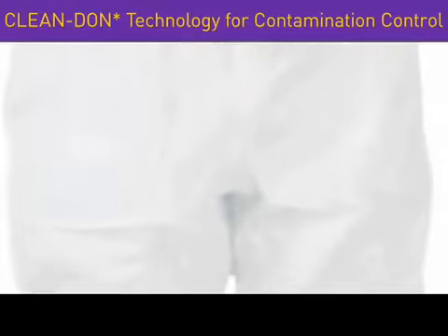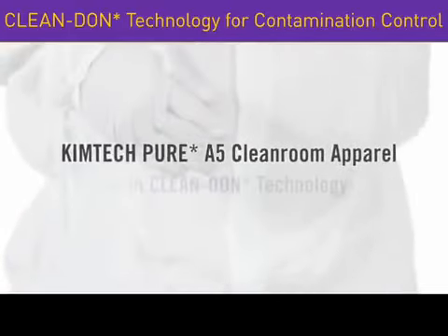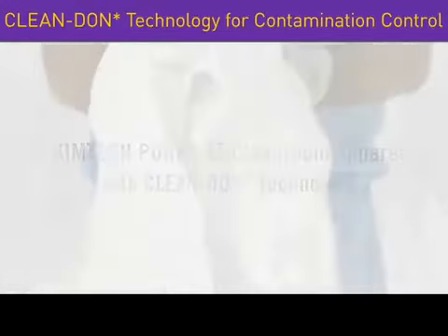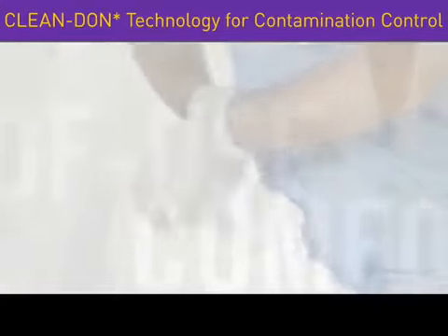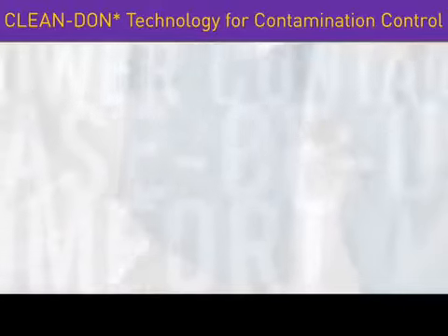Hello, and congratulations on discovering the new KimTech Pure A5 Cleanroom Apparel with CleanDon Technology. This advanced technology allows our innovative garment to deliver comfort and ease of use, all while helping you lower your contamination risk.